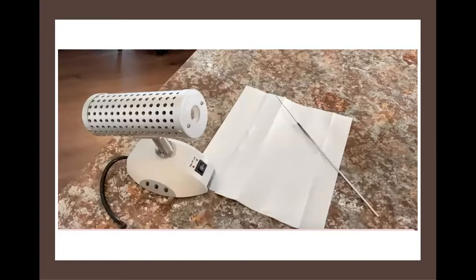So those are the two containers that we encounter the most, and those are the two containers that we move cells between most often. So what we'll look at in this video is how to do all of that moving using our very best aseptic technique.